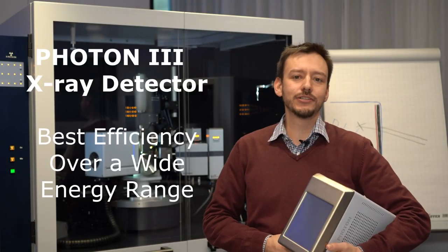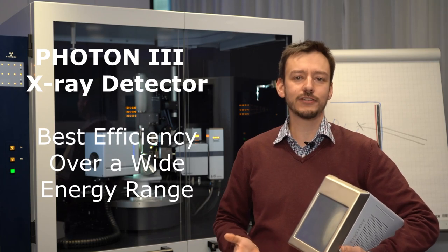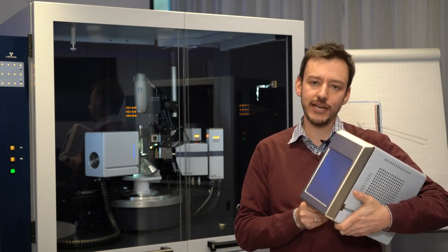Hi everybody and welcome to this video on X-ray detector technology. My name is Tobias Stürzer, I'm head of the single crystal applications team at Bruker. Today we're going to talk about detection quantum efficiency of your X-ray detector.